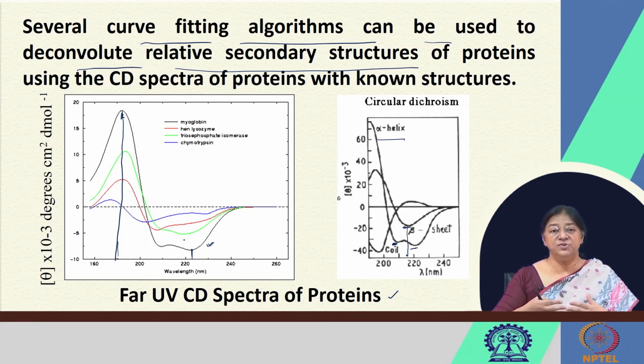The information from the CO stretching, the NH bending and the NH stretching gives us information about whether there are any variations. Now, if we are looking at the unfolding of a protein, then as we saw in the protein denaturation techniques, when we are trying to understand whether we have the folded protein or the unfolded protein, there were specific spectroscopic characteristics that we could look at to monitor this effect.